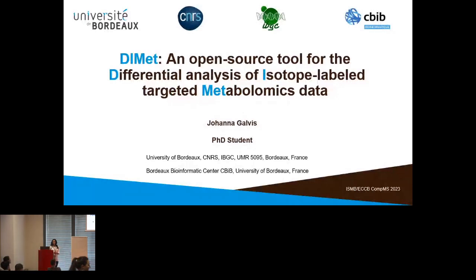And by using DIMet, the questions about metabolite abundances and labeling speed can be resolved. And we have a level of pathway-based integration with other omics. We are also working to be able to automatize the network projection for combining both omics, metabolomics and transcriptomics.